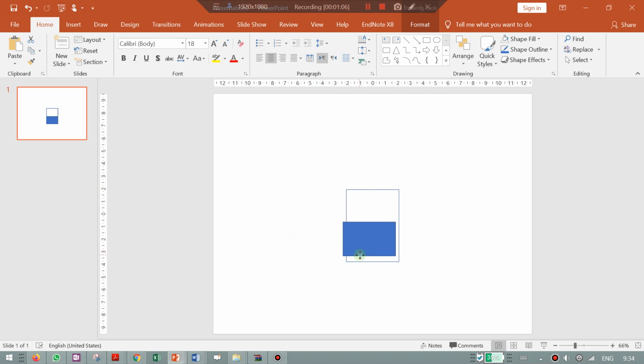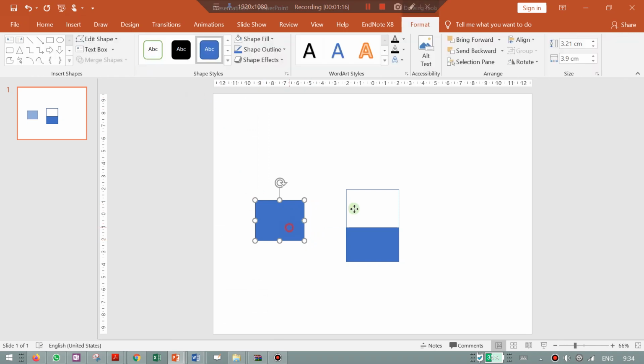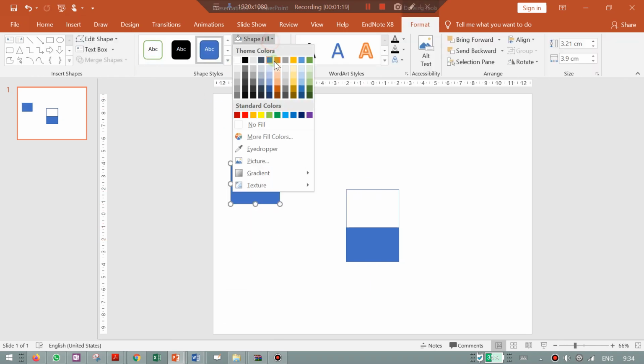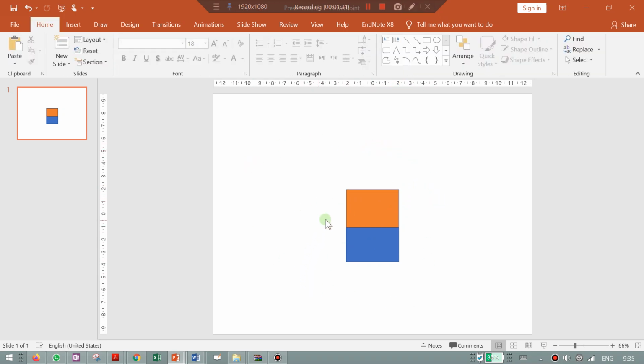You put your sample inside the container, and then the next process of LLE, actually, you add your solvent of extraction. This is just the basic information only. So you have your sample over here, and you have your solvent of extraction over here. So let's imagine.